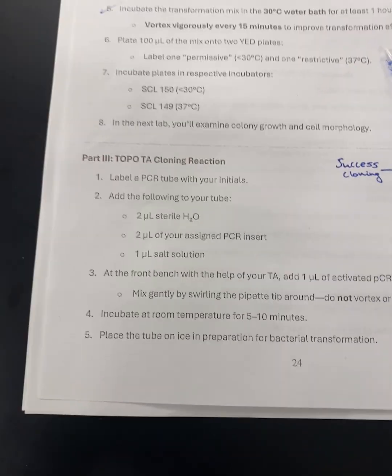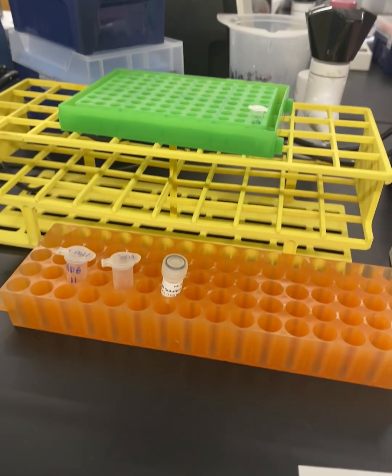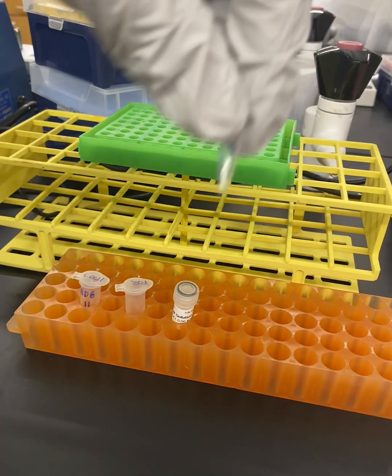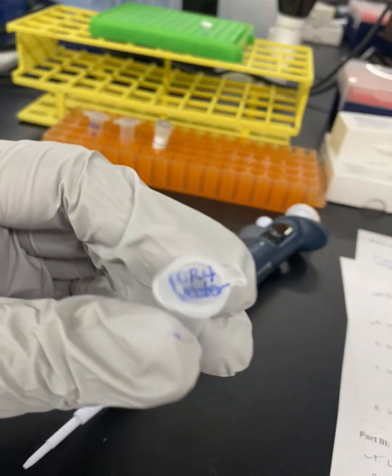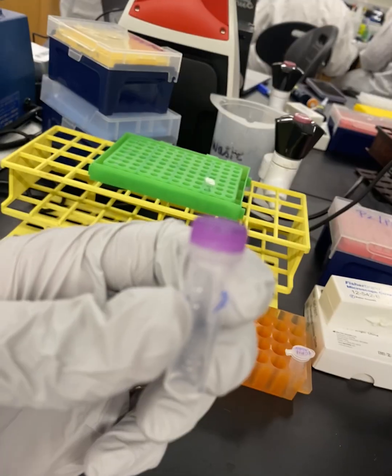Now let's walk through the recombinant DNA workflow with the actual methodology that we used in lab. First, we add the PCR amplified mutant CDCX gene to the TOPO vector. As soon as the AT pairing occurs, the topoisomerase ligates them together in seconds.